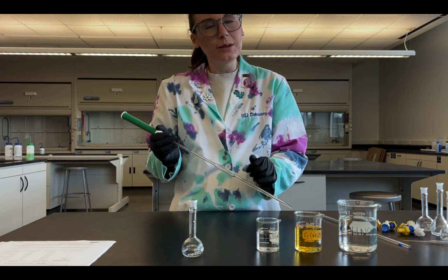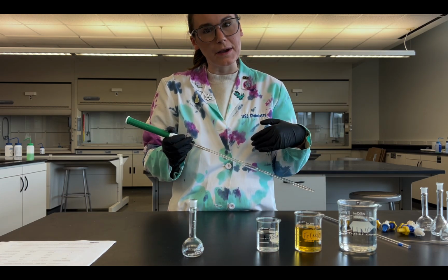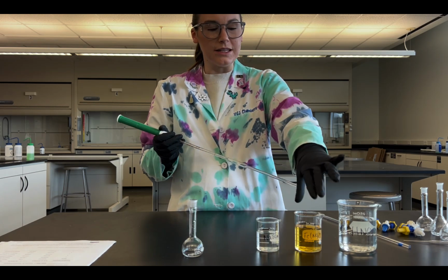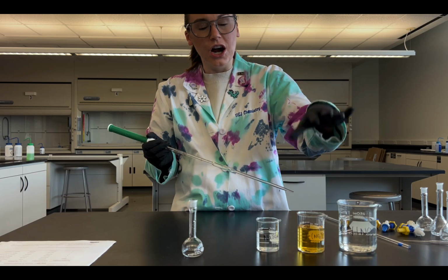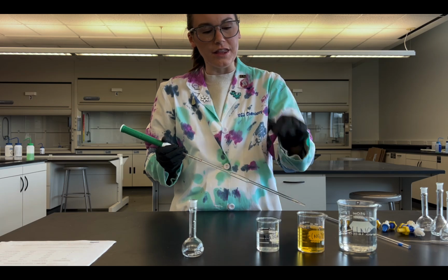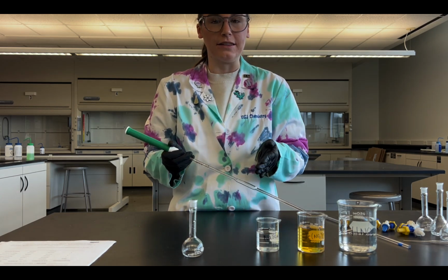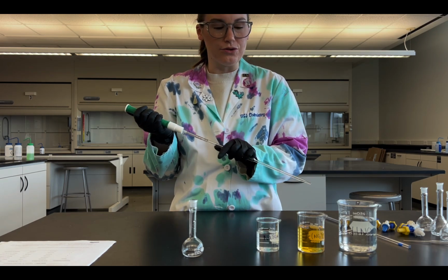The reason this is called a blank is because it's basically the solution that when we go into the spectrometer, we want to cancel out. We can see that the iron nitrate is orange, and as I said in our pre-lab lecture, our final solution is going to be red. Basically what this is going to do is tell the spectrometer, cancel out all of this wavelength of color and only focus on the other wavelength of color that I want. Okay, so this is what we consider a blank solution.